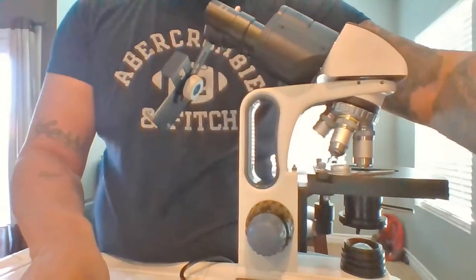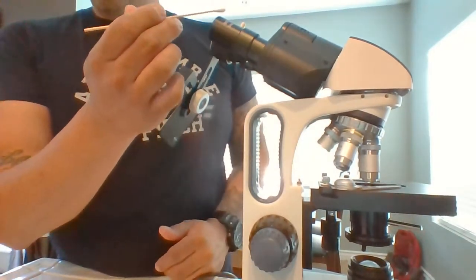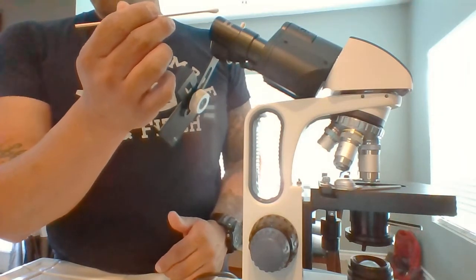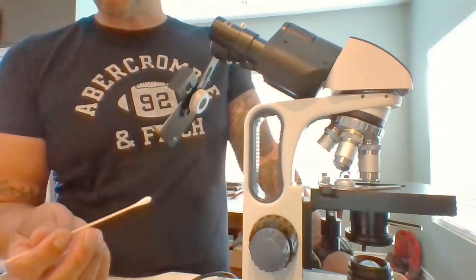In this video, I'll be going over a couple things. First, I'm going to start off by going over areas of the microscope with the camera. First, we're going to talk about the eyepiece. It's used for observing the slides. On many microscopes, this will magnify the specimen 10 times.